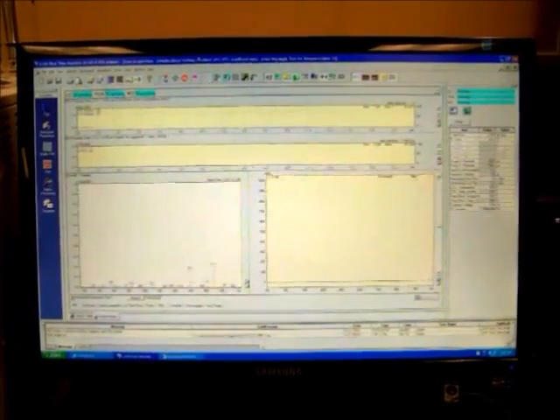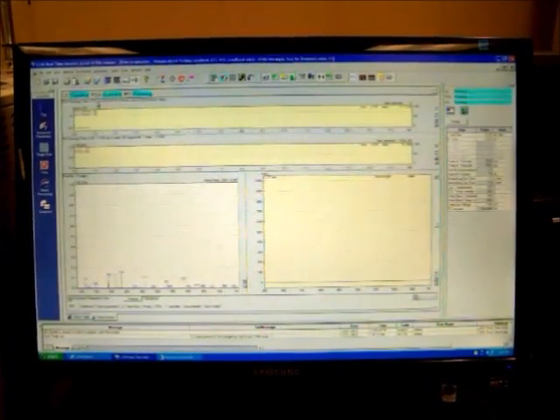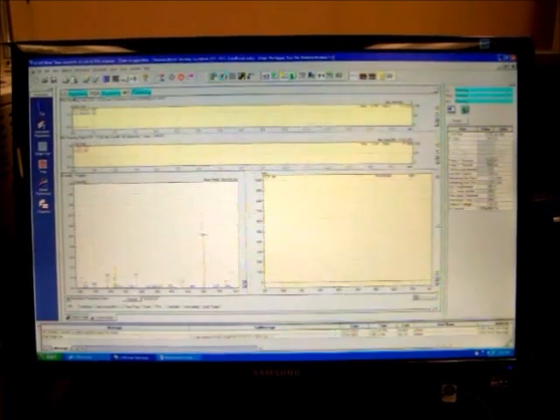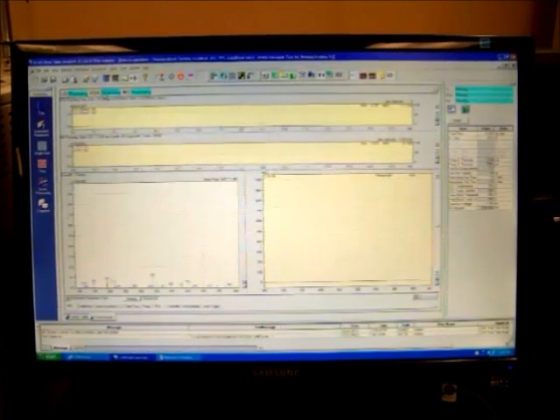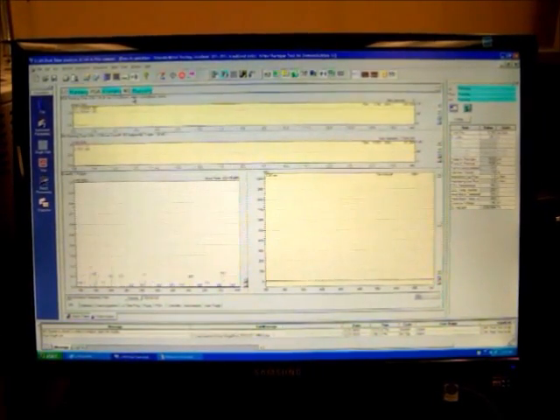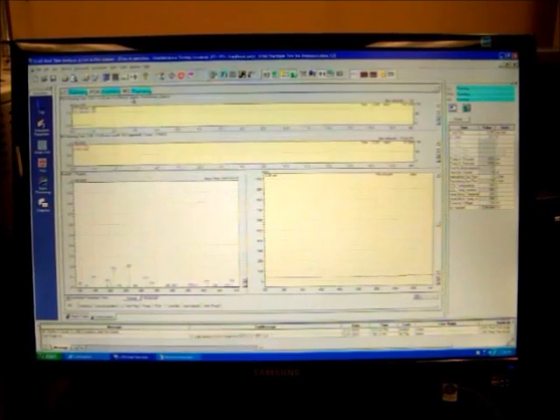So now the run's started. When the run has commenced, you will see the LC, PDA, and MS all indicating running, meaning that the instrument is well running.